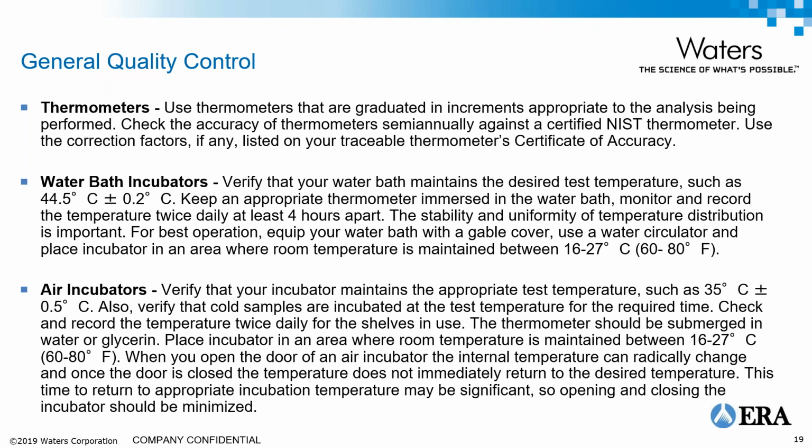You also want to check that when you open the incubator door and you close it, how long does it take to refresh back to the appropriate incubation temperature? You don't want to get in and out of that incubator a lot when you're running your samples.